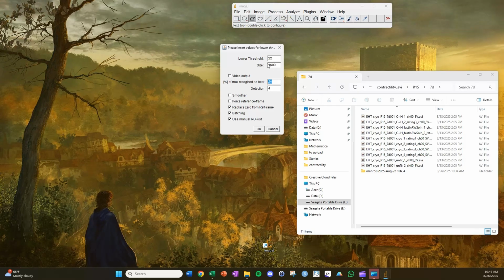This one doesn't matter. These, I think, probably are important for how it's detecting things. I just leave them as the default. Batching we do want definitely checked, because we want them to go through all the videos in this folder. And then, yeah, we created an ROI list, so we definitely wanted to use that ROI list. Great.